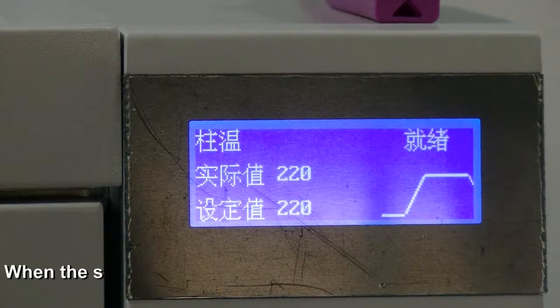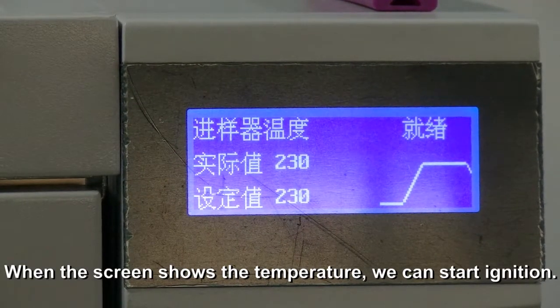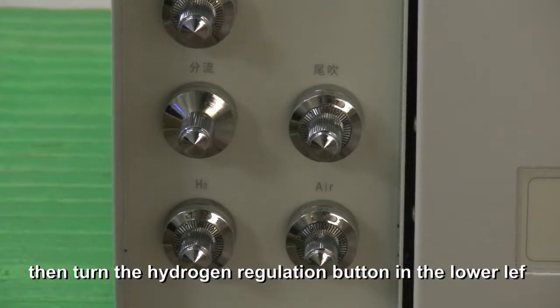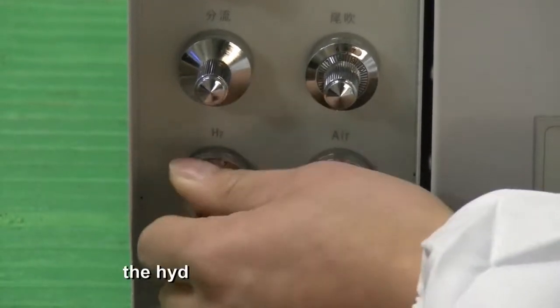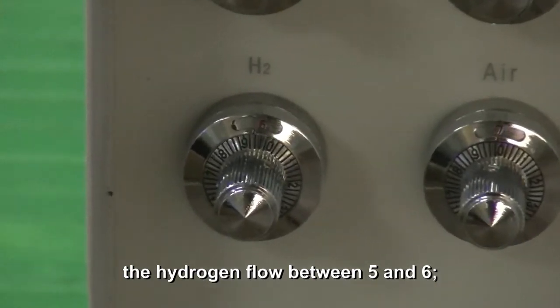Ignition. When the screen shows the temperature, we can start ignition. Before ignition, press signal 1. The screen shows a value of 0. Then turn the hydrogen regulation button in the lower left corner and adjust the hydrogen flow between 5 and 6.